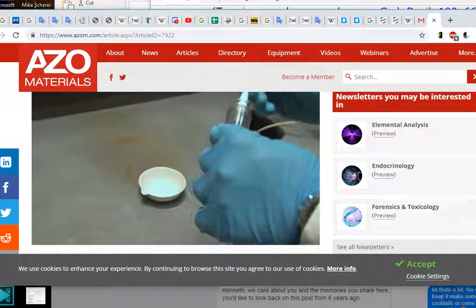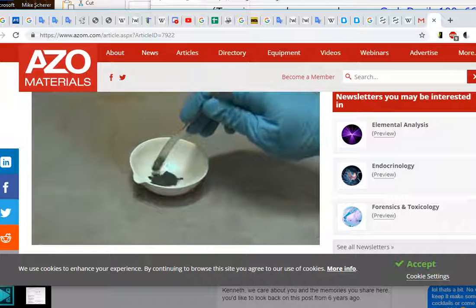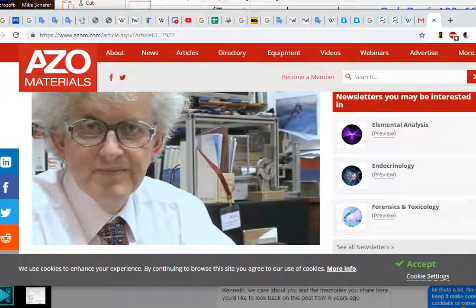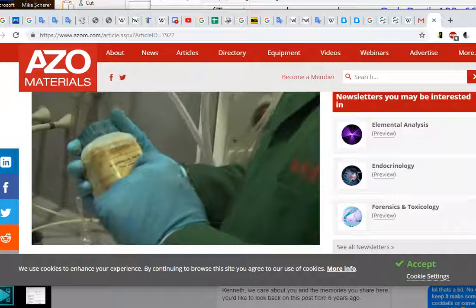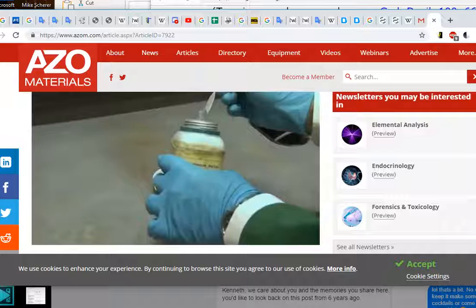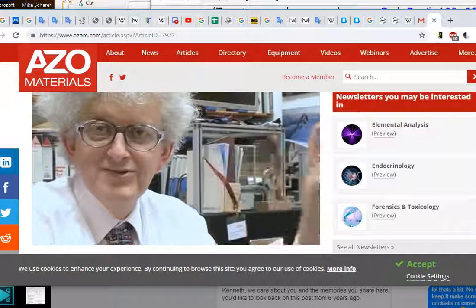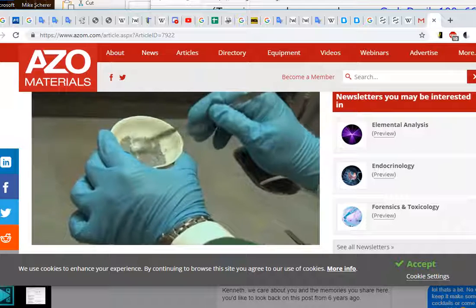You can see this development effect of iodine really well, that if you have tadpoles, baby frogs, they don't develop their legs and turn into frogs unless there is iodine in the water. The other component in this reaction is aluminium, okay? And we're using very, very finely powdered aluminium, not foil or a rather large lump. This has been specially powdered for us, so again it has a very, very high surface area. One of my favourite chemical equations is tadpoles plus iodine goes to frogs. So you can see the aluminium and the iodine mixed within this solid mixture.